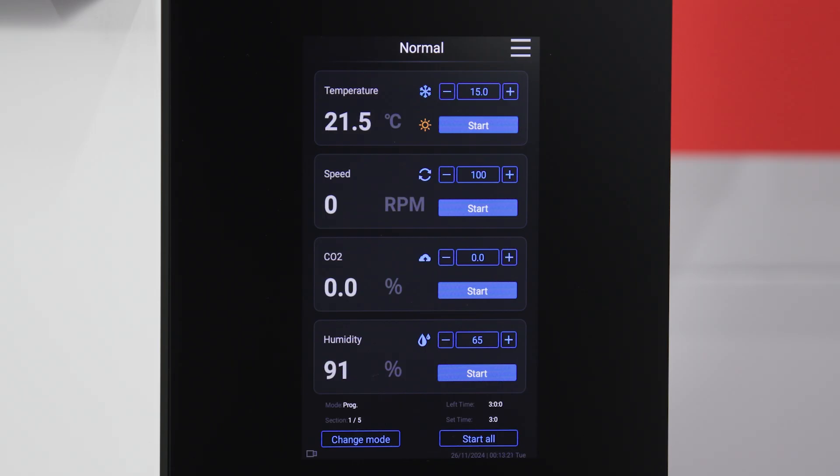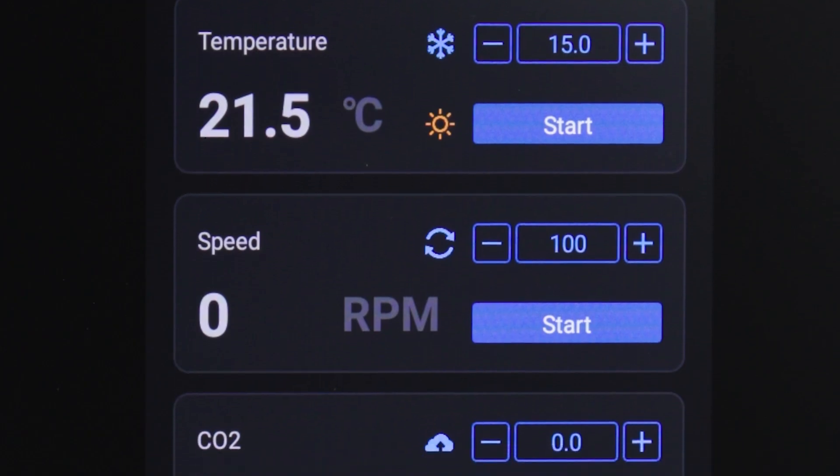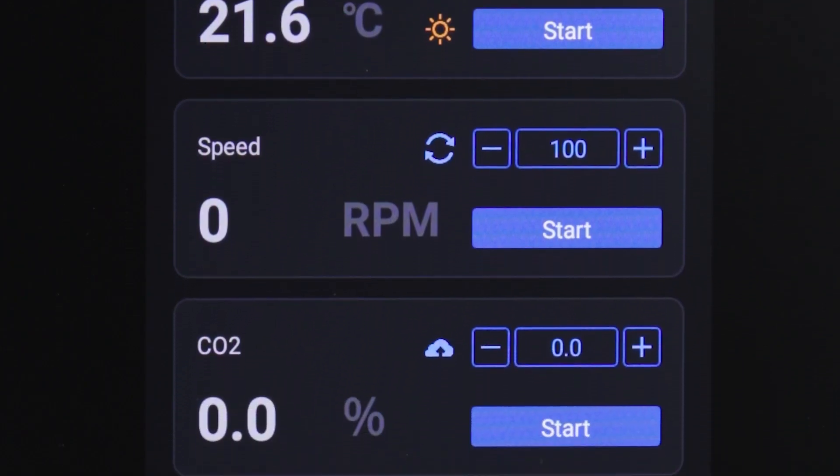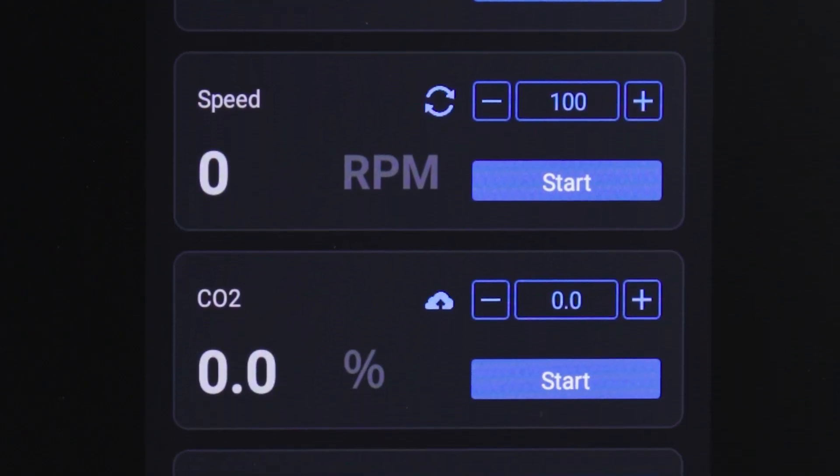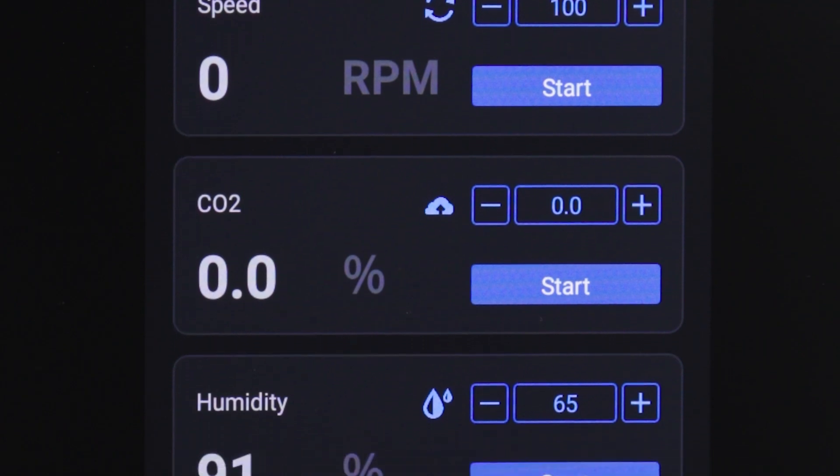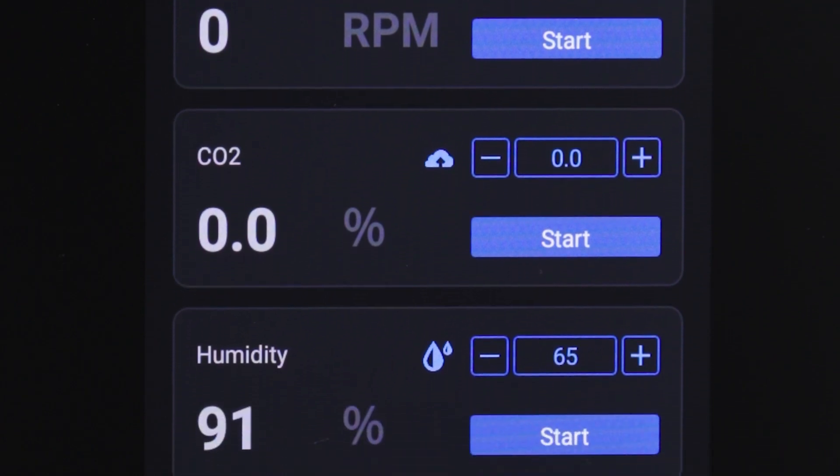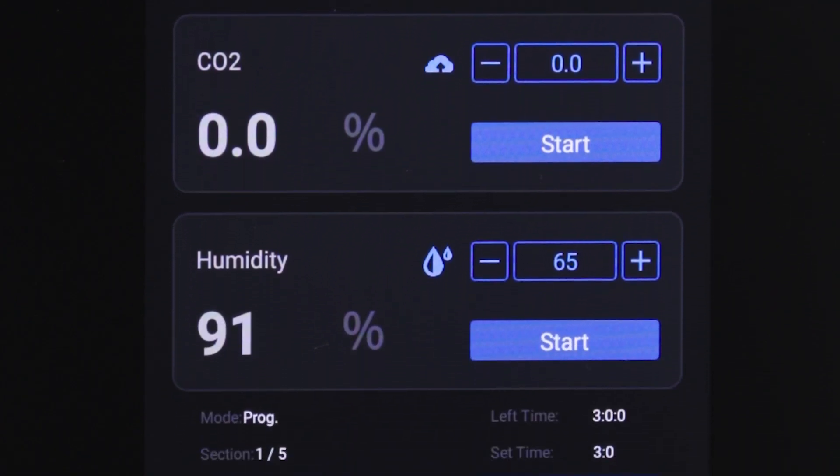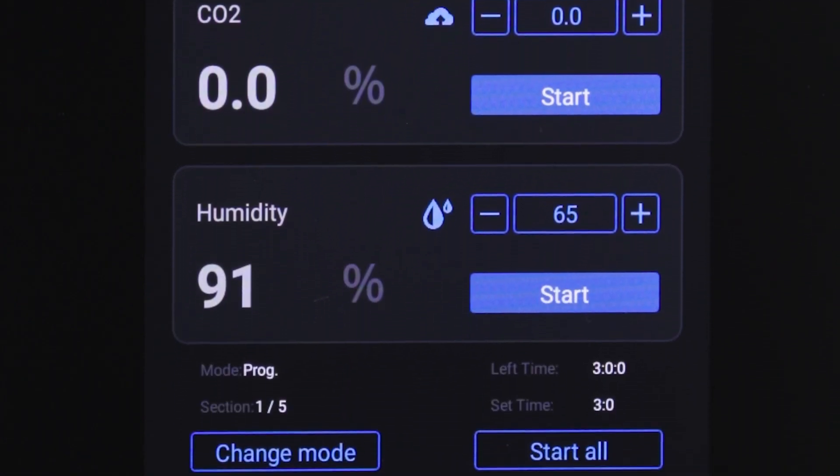The main interface displays the key performance information and settings for your shaker: temperature, speed, humidity, and if you purchased a CO2 incubator, CO2. Each of these can be controlled in the same way.